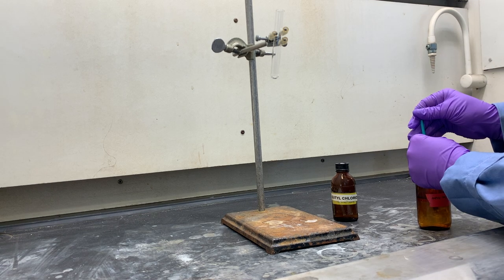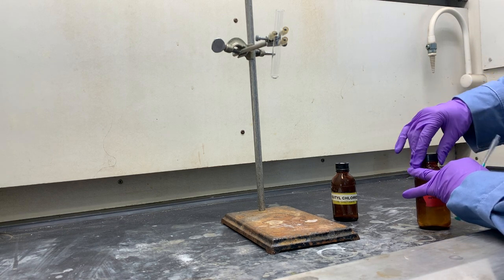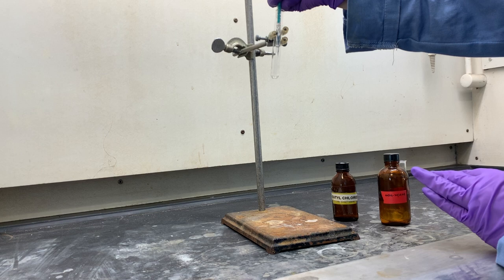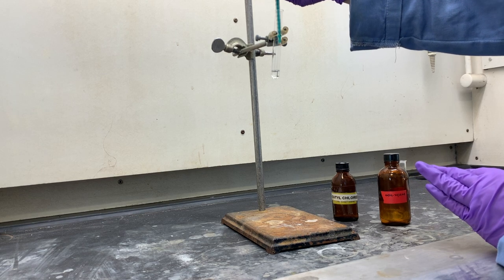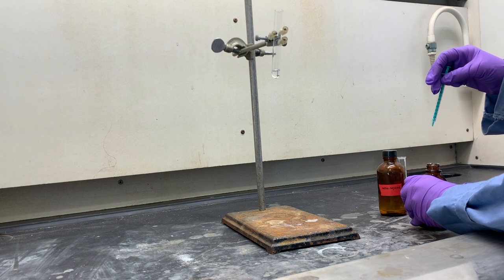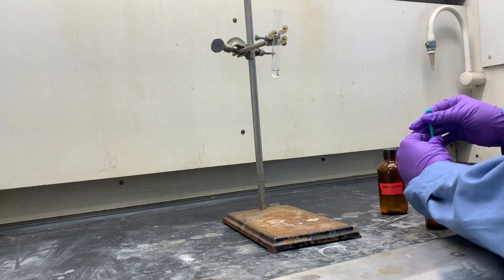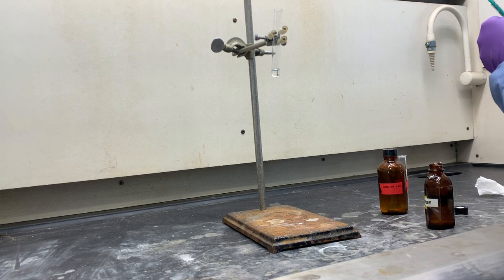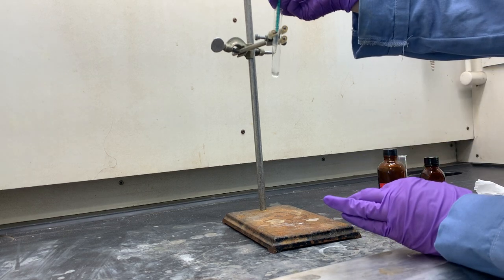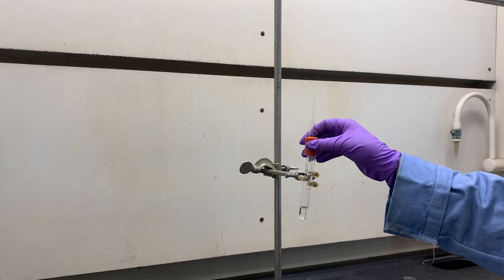To a clean, dry test tube, add m-Xylene and tert-butyl chloride. Clamp this test tube to a ring stand. Insert a Pasteur pipette into the thermometer adapter.